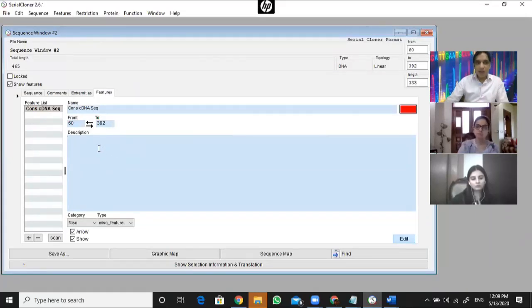I can add some additional description here of my own choice. I want to create a mutation at the base pair number 85 to 90. I want to delete those 5 or 6 base pairs from 86 to 90 base pair. I'm just putting some random example. Whatever the things you want to write along with that sequence and feature, you can write here.